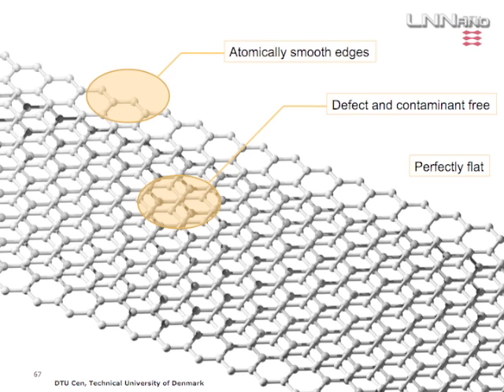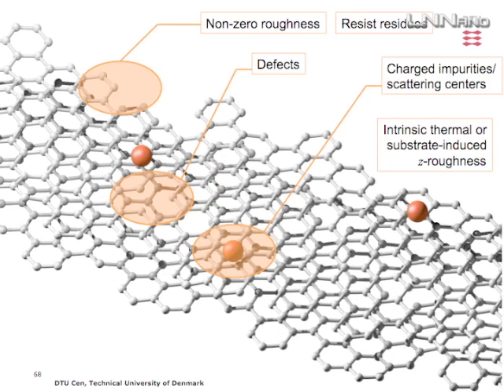Can't skip that one. Graphene, of course, is one of the most interesting materials at the moment. So more or less every group with a microscope is doing some kind of things with graphene. Ideally, this is what it would look like: nice smooth surfaces, nice single layers of graphene, perfectly flat, contamination free. Unfortunately, this is for the most part what it looks like. You have contaminants sitting on the surface. You have jagged edges around the surface here. Residual materials from the fabrication.